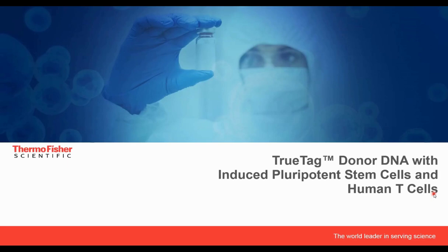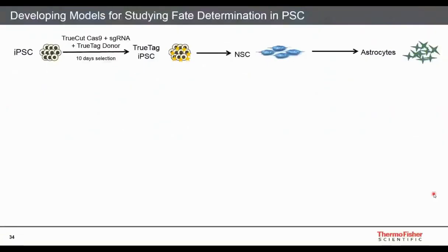So moving into our last bit here, we're going to talk about 2 case studies where we're looking at pluripotent stem cells and T cells and the TrueTag donor DNA system.